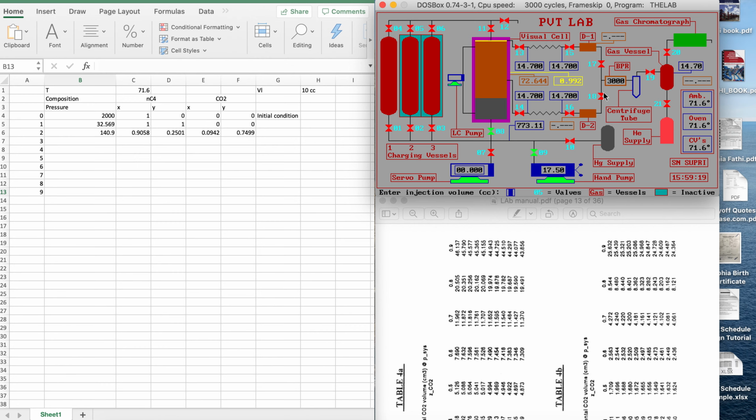Okay, I'm going to now inject 0.9 back. I'm going to shake this out. It was too much. I'm gonna inject minus 0.2. I'm gonna remove 0.2.